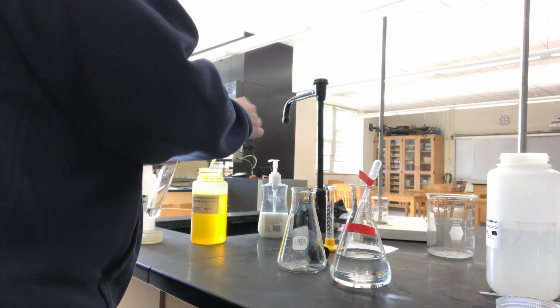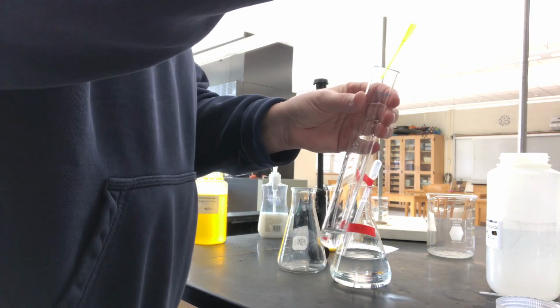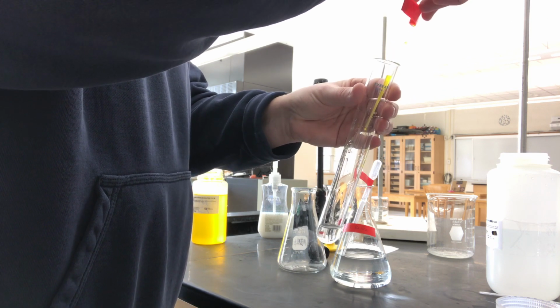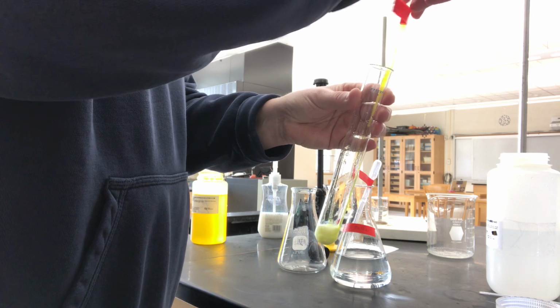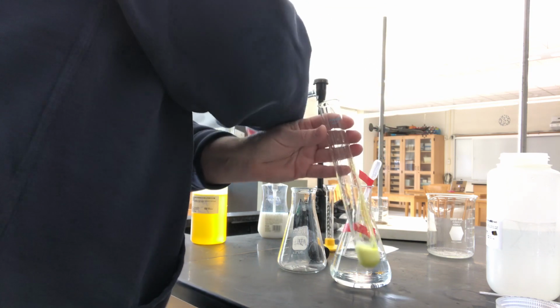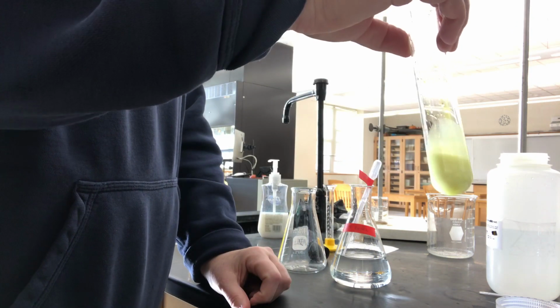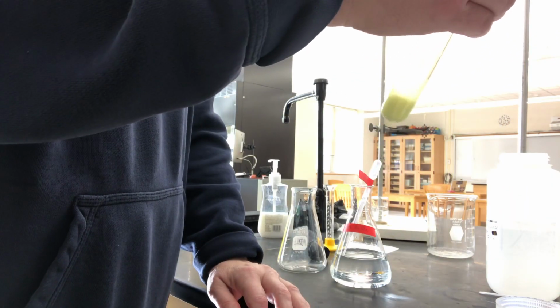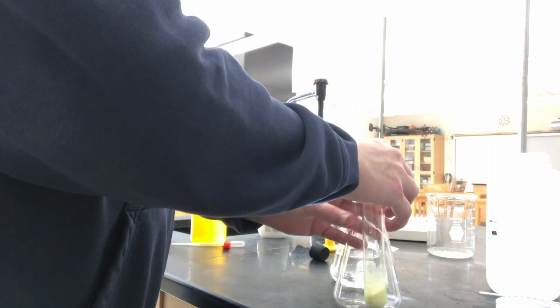So barium chloride was a clear colorless solution. The potassium chromate is yellow. So as I add it, you'll see that we form a precipitate. So you've gotten all cloudy again here. Okay, so you're seeing a precipitate, looks like a pale yellow precipitate. So now we've got our barium chromate is the precipitate we just formed.